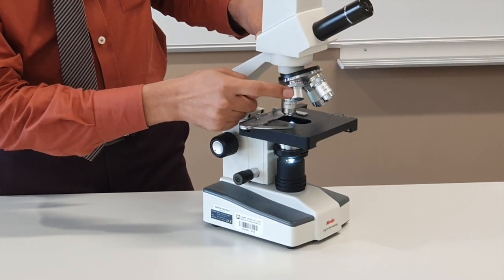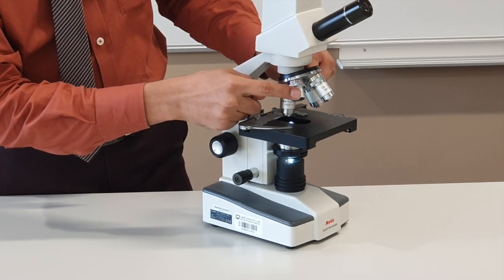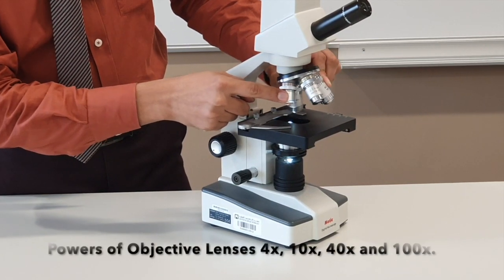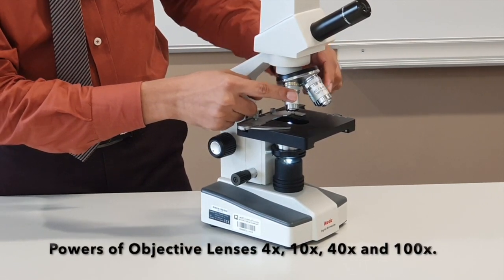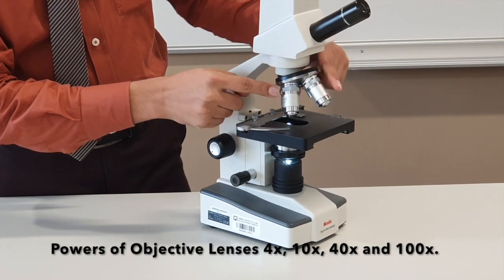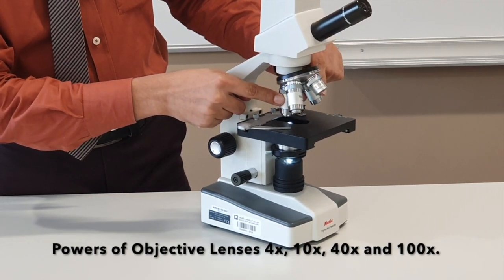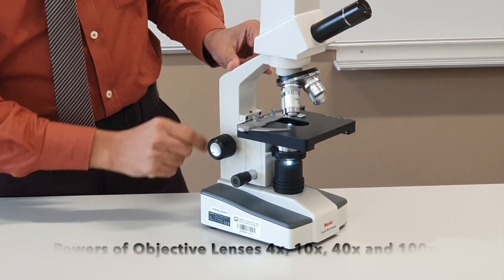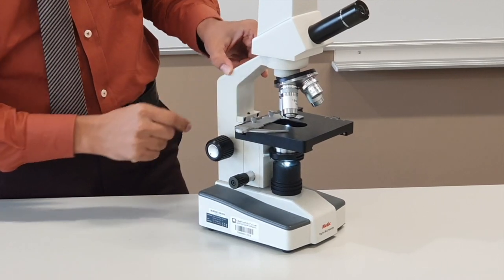If you see right now, this is 4x. If I keep rotating it, the next is 10x, the next one is 40x, and the last one is 100x. These are the different types of high and low power lenses which are used for magnification of the image.